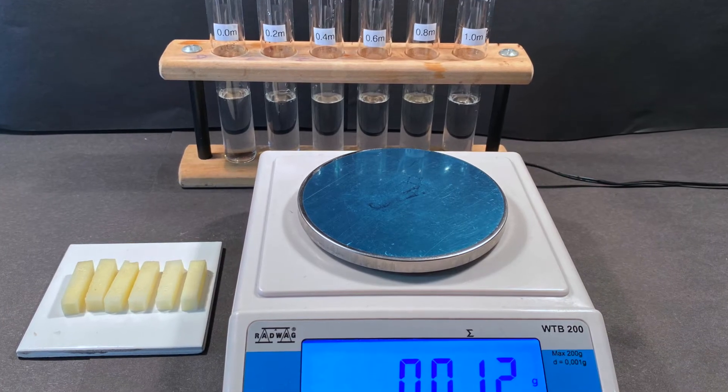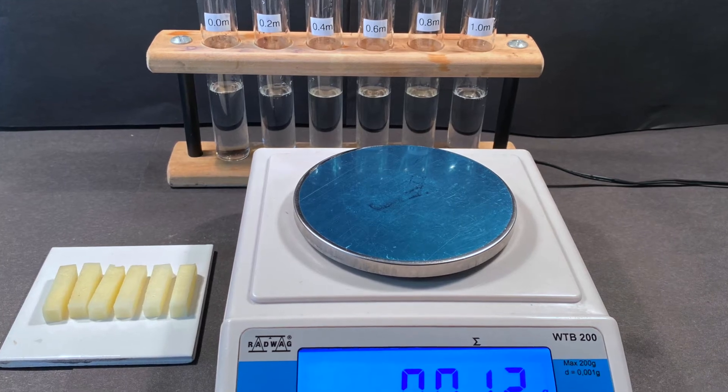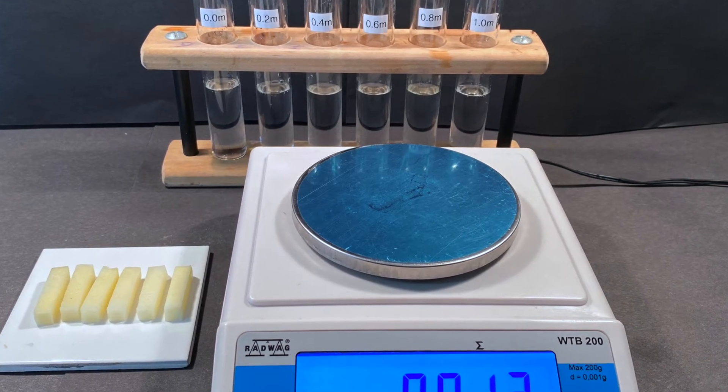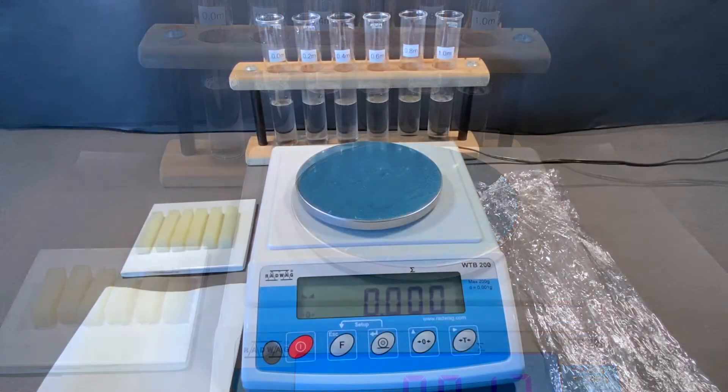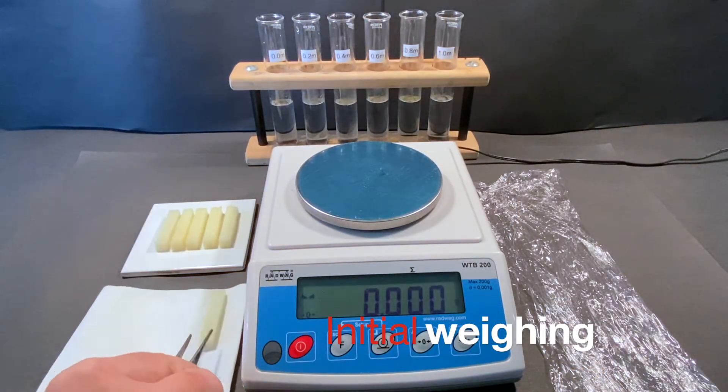At this stage of the investigation your equipment and samples should look something like this. The process of weighing the potato sections can now begin.